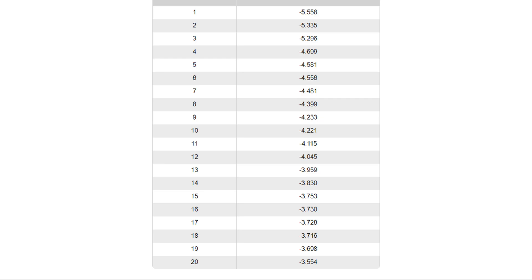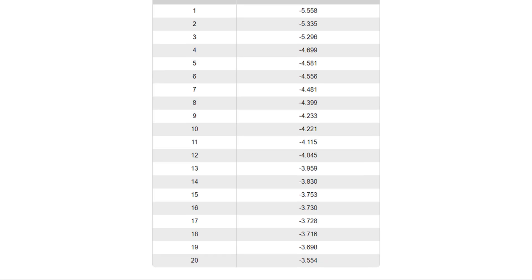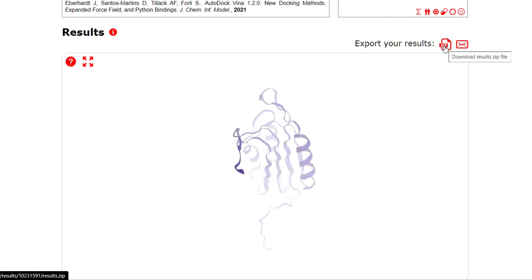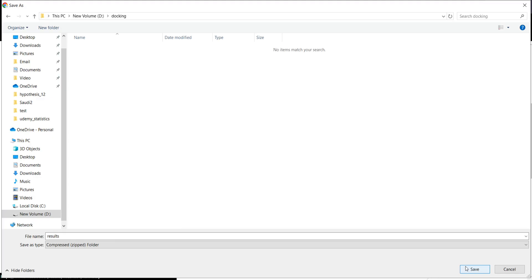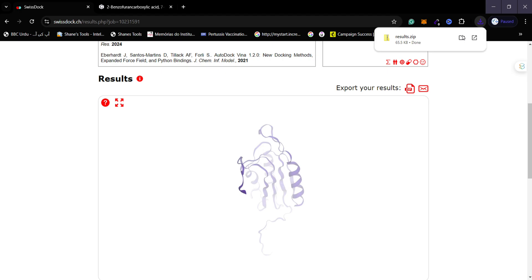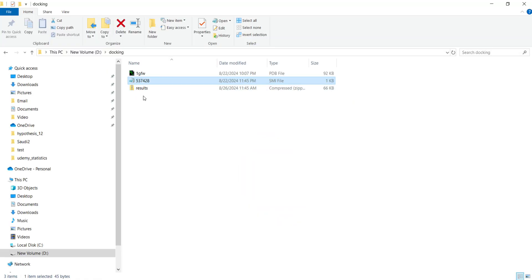So our first pose will have the strongest binding with our receptor. To download the results, scroll up and click on the ZIP button. A window will appear and your results will be saved in ZIP format at your desired location. Once downloaded, navigate to the docking folder where you can see the results ZIP folder. Right-click on it and from the drop-down menu, click 'Extract Here' to extract the contents.